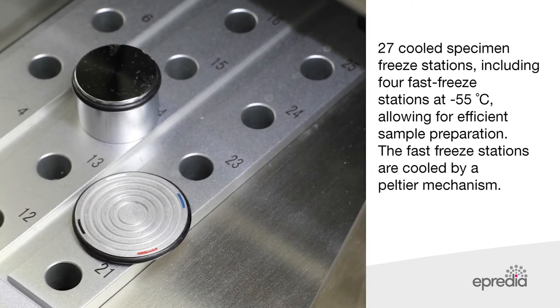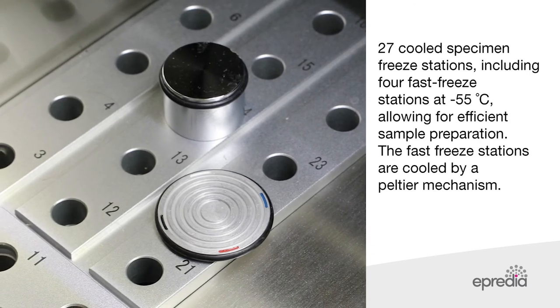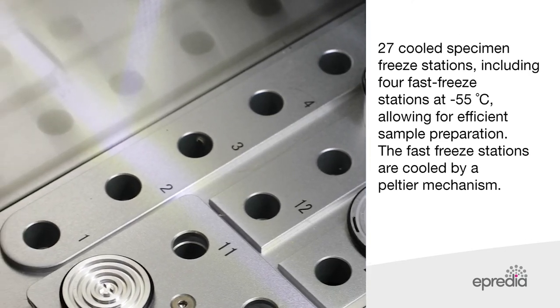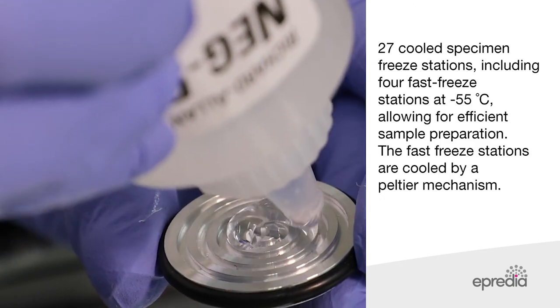The HM525NX has an efficient high-throughput cryo chamber with 27 cooled specimen freeze stations, including four fast freeze stations at minus 55 degrees Celsius, allowing for efficient sample preparation. The fast freeze station is cooled by a Peltier mechanism.